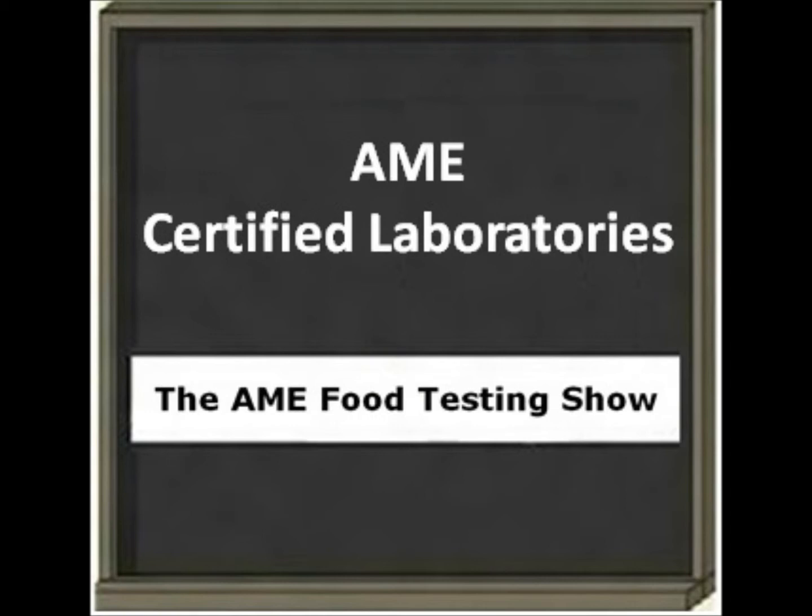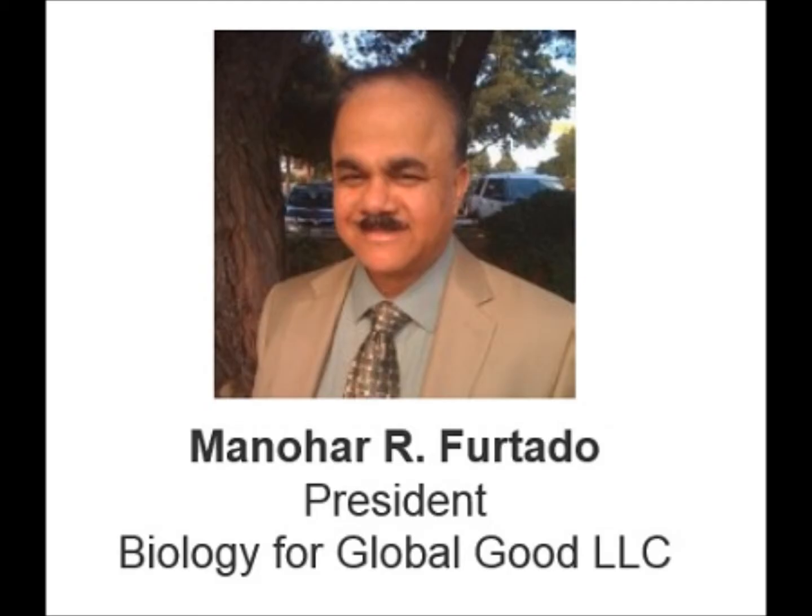Excellent. What methods are traditionally used to detect avian influenza virus infections? So influenza viruses have been around for a long time, and the oldest detection tests were largely cell culture based. So you would take a sample from someone who's infected, put it on a bed of cells in tissue culture, and then wait for the virus to grow, and then detect it by an antibody or something like that. Typically, those tests used to run for 1 to 10 days.